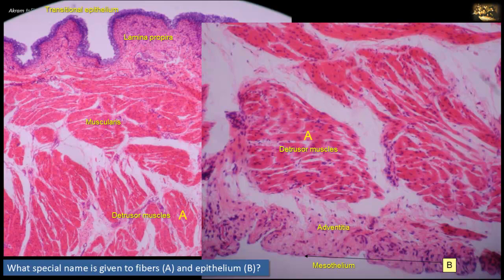The mesothelium shown here at B is simple squamous epithelium.